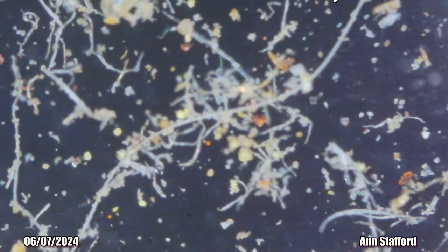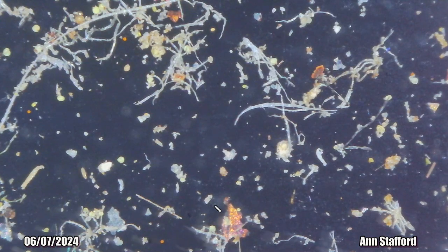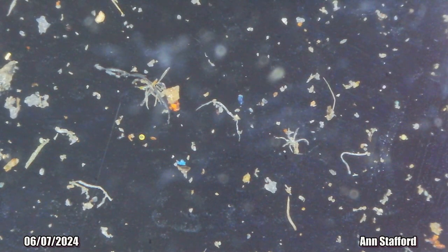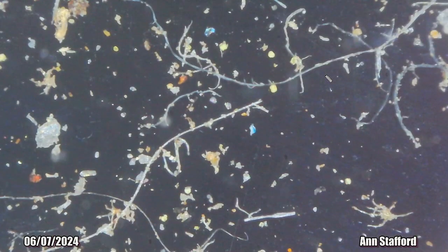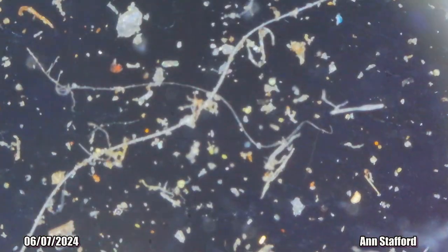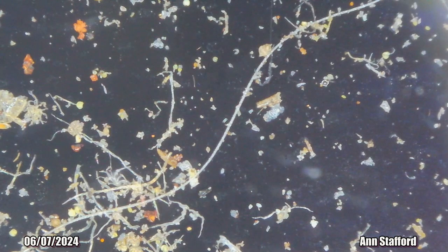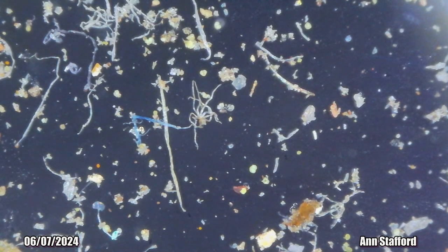Now mostly, let me get it in focus. Mostly they are this white, clear, but sometimes they're more yellowish. Sometimes they are completely white, and sometimes like this one has a little bit of an orange color in its centerpiece. Sometimes the little head. Okay, this one, see, it's got a little bit of an orange color to it. I can't get it better than that, but I think you can see what I'm saying. See, this one looks pretty clear. Okay, see, that one actually has a little bit of an orangish color. I know it's very small and hard to see.